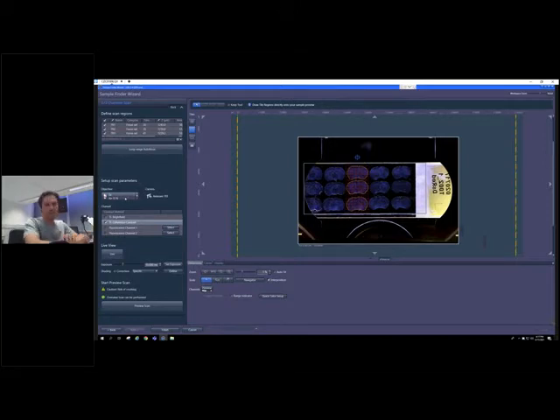So we are on a 5x magnification, and another nice feature that we technically introduced with the AI sample finder is a contrast technique called coherence contrast. This coherence contrast is based on the coherent illumination, the far red illumination in the condenser, and basically gives us a very crisp contrast, allowing us to run, for example in an experiment or as a preview scan, this contrast image here.